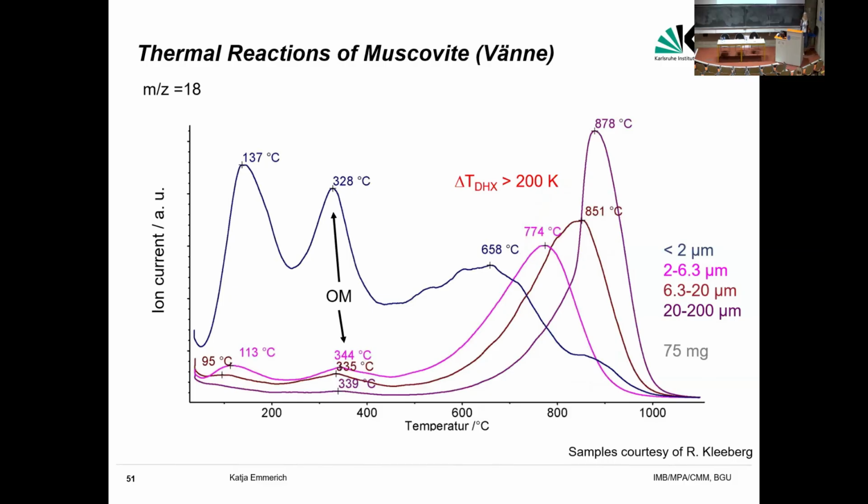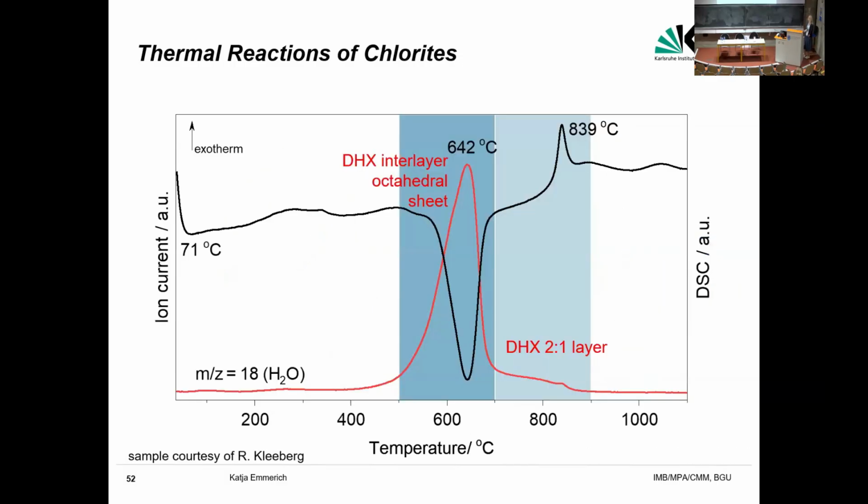Again, this is a kinetic effect, because after the dehydroxylation, the water molecules have to find their way out of the material. And if you have a large particle, the way is longer. And then the peak maximum is at a different temperature.